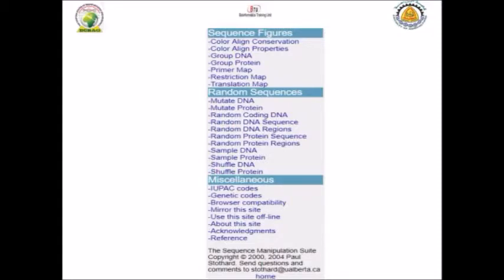There is also a section called Sequence Figure that can produce colored figures. Another section provides Random Sequences if you need random sequences for your study. The last section, called Miscellaneous, contains IUPAC codes, genetic codes, and other things that are very useful in teaching bioinformatics.